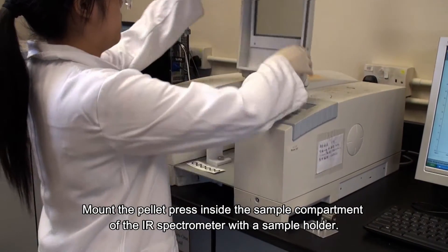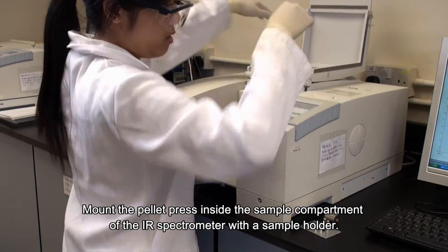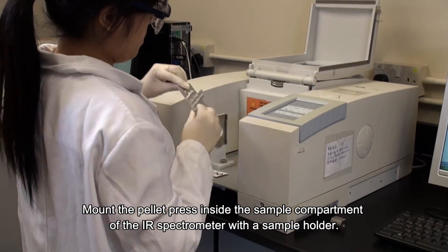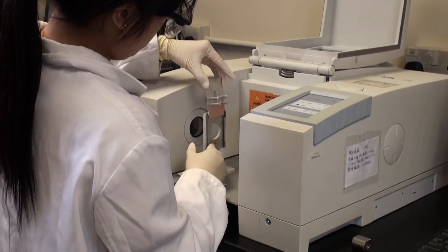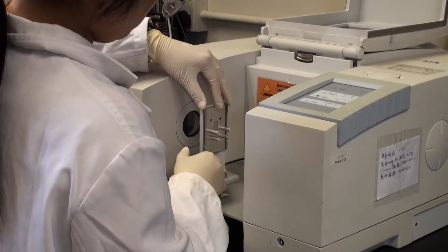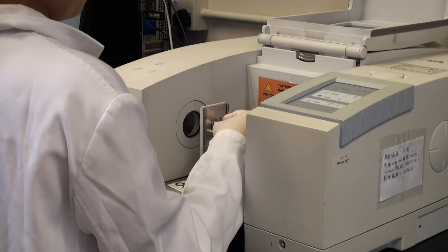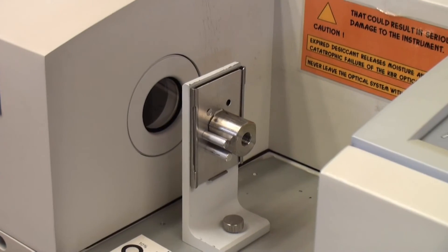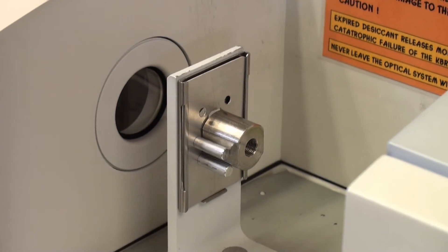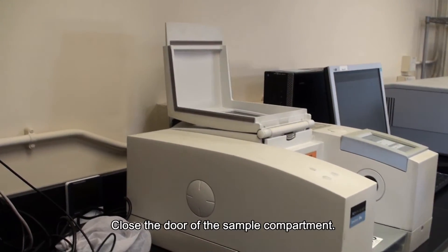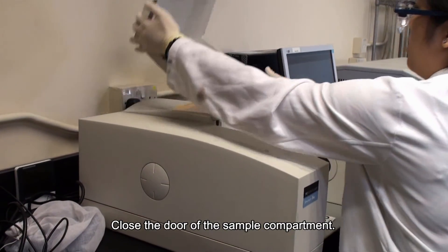Mount the pellet press inside the sample compartment of the IR spectrometer with a sample holder. Close the door of the sample compartment.